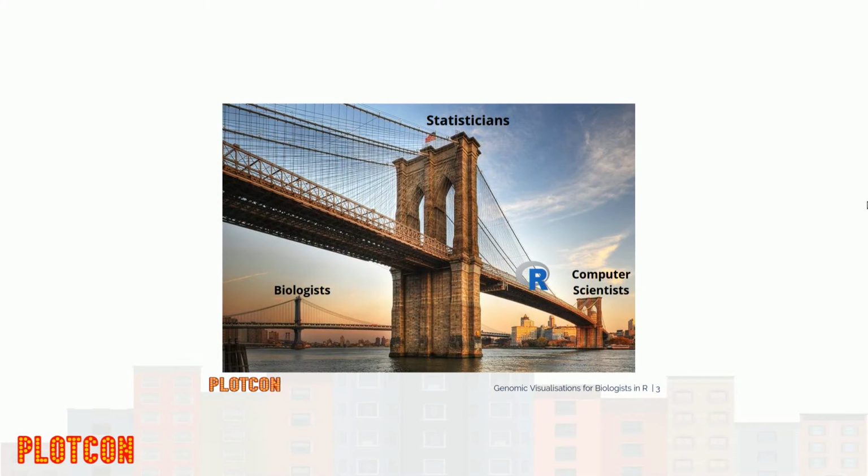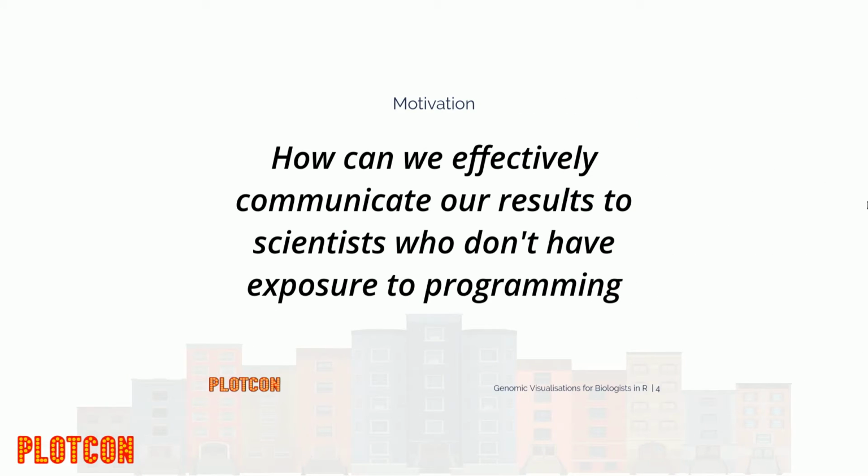And so the question I'm trying to address with this package is, how can we effectively communicate with people who aren't natural programmers or who don't program all the time?